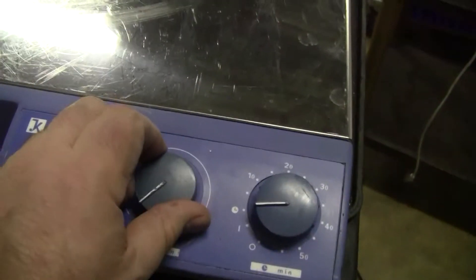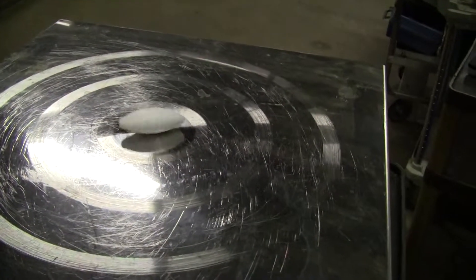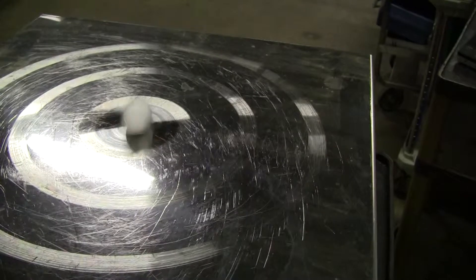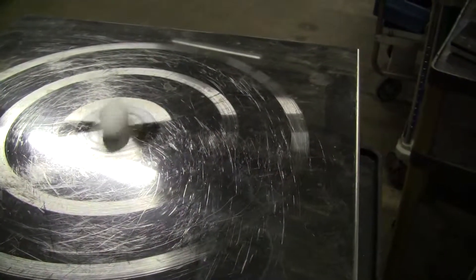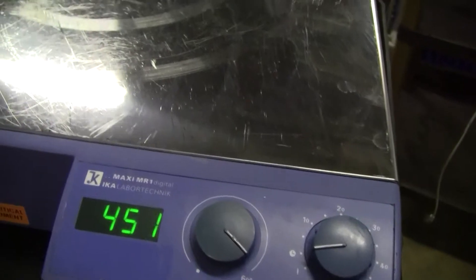It has a timer. It's currently on — let's crank it up. The readout goes to 600. I'm going to guess that's 600 RPMs, but I'm not certain.